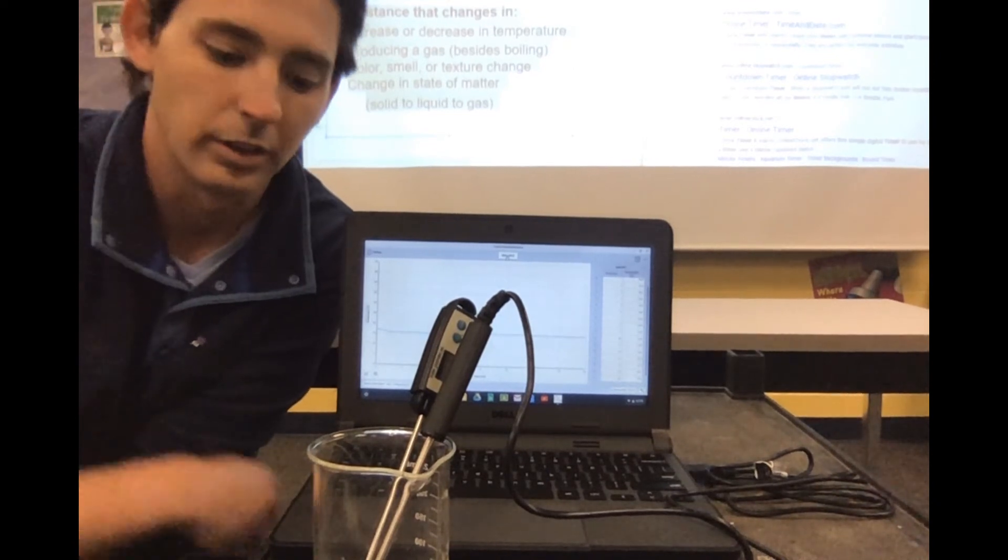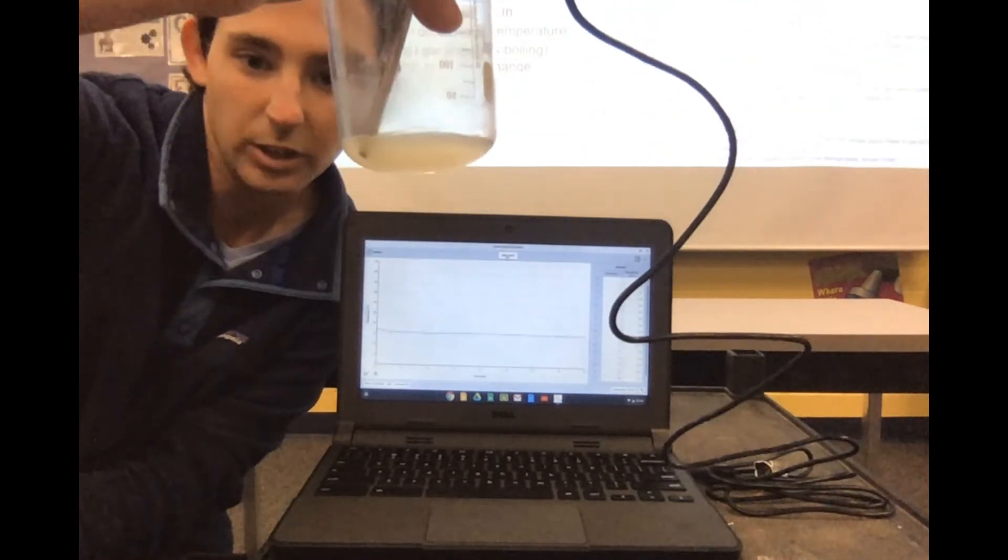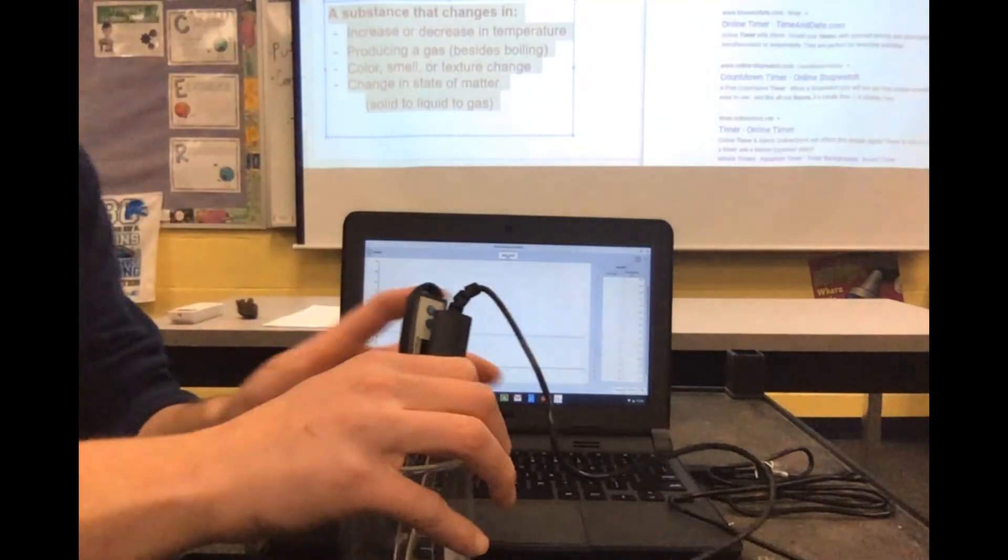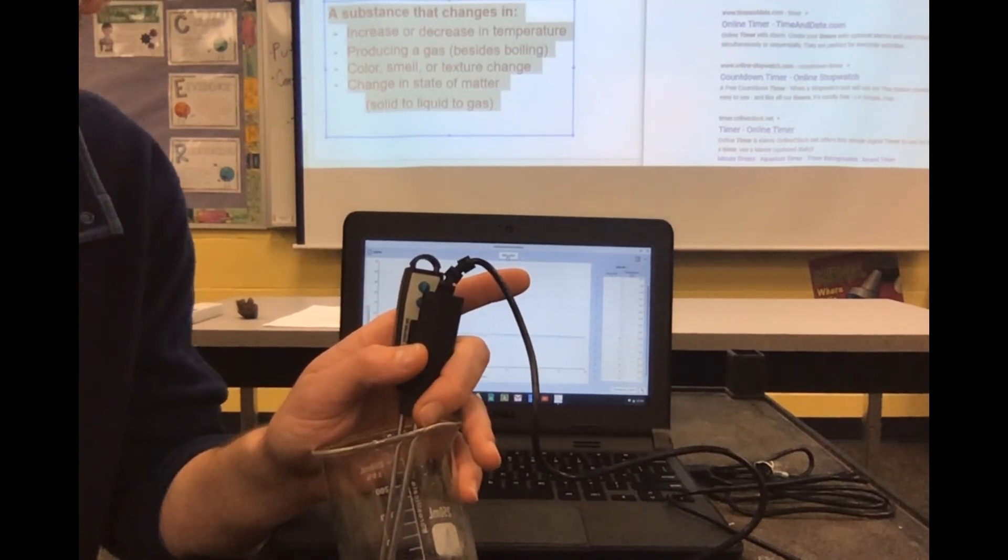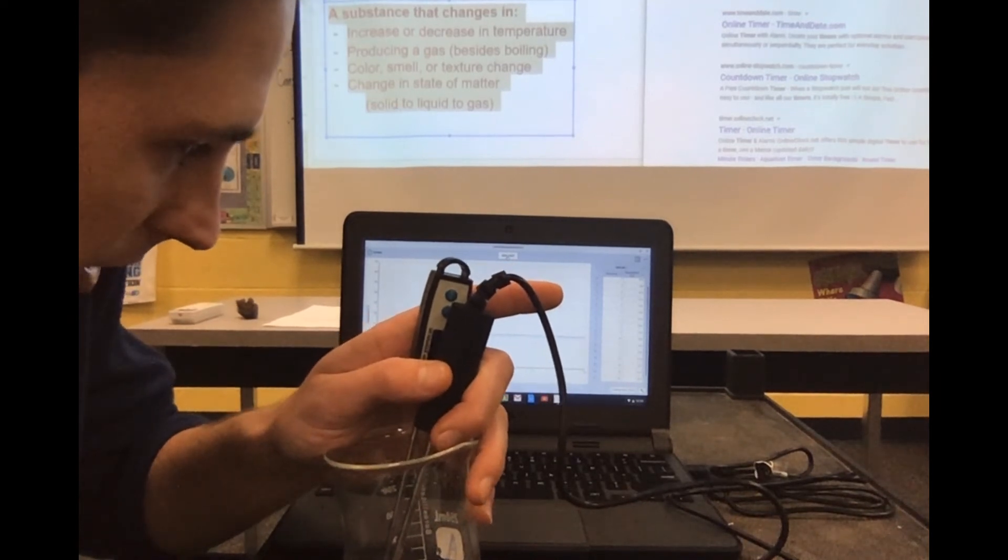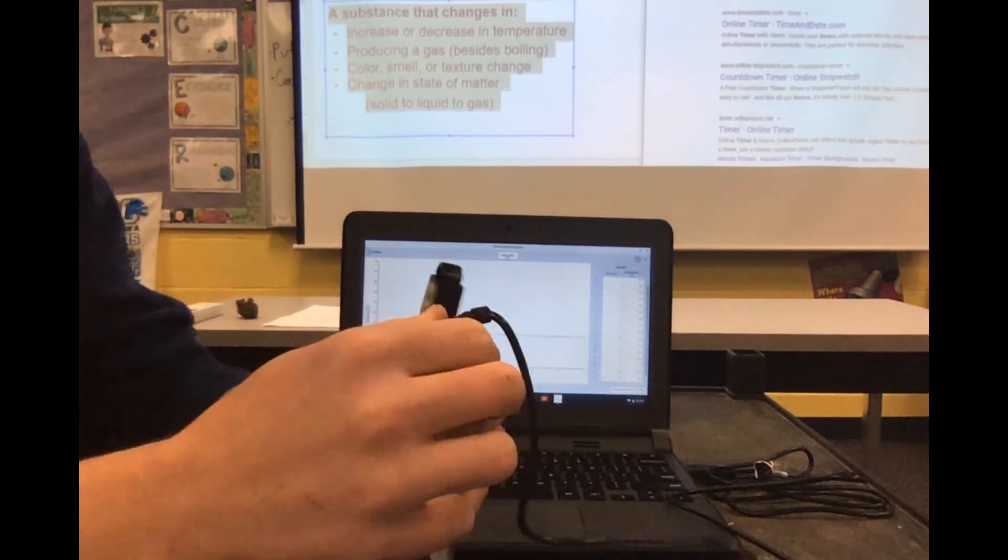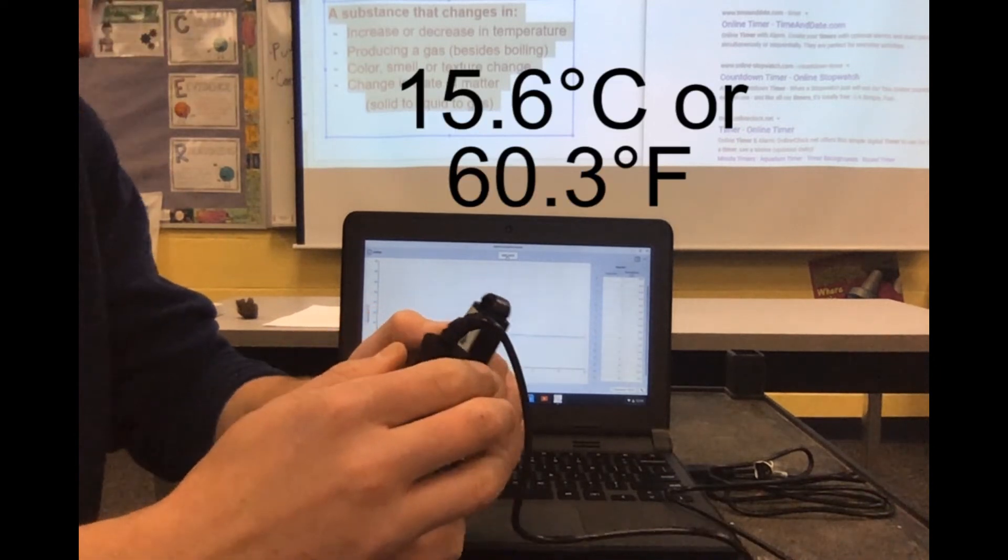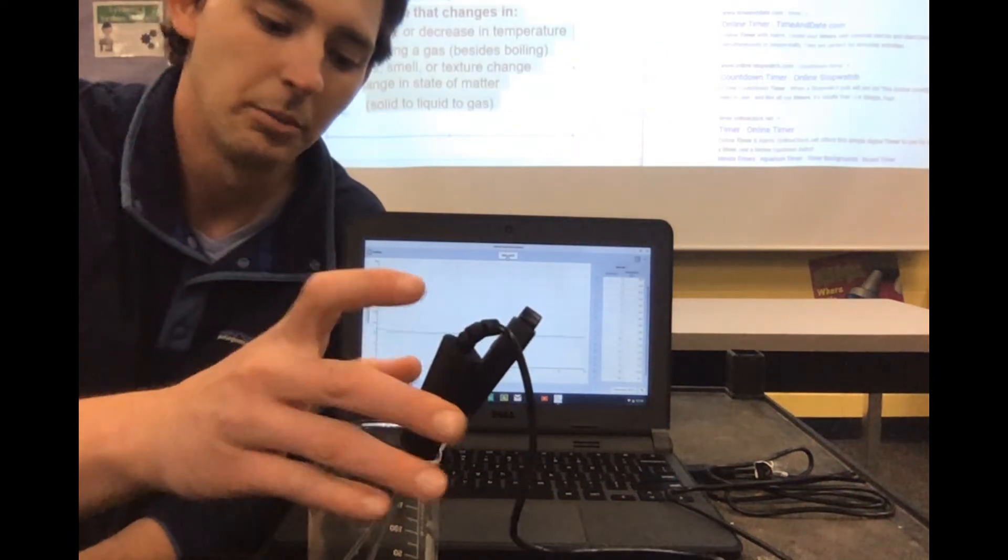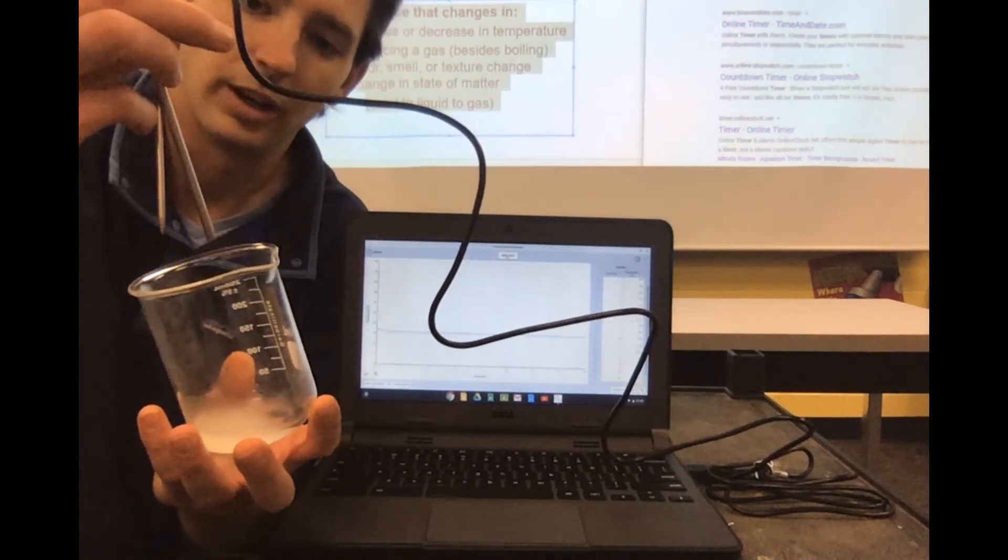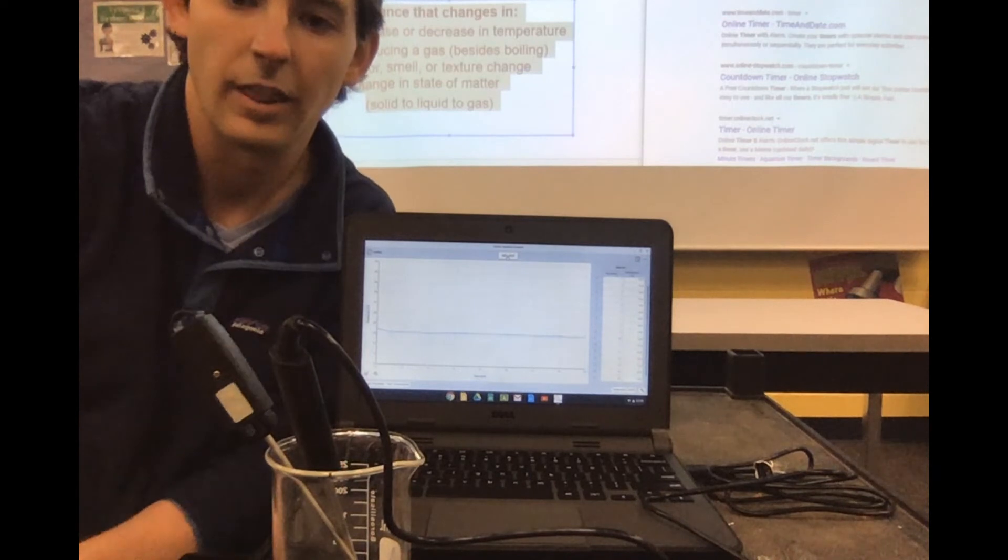15 seconds for your last one. Any other observations you can see to write in your data table, it looks like there is much less liquid now than there was. And let's see about the final temperature. 15.6 for some reason, and this is 60.3. So the temperature did decrease, but it also increased just a little bit, but that's not due to the reaction. That's probably because there is a little amount of this and the temperature that's actually being read is some of the air temperature because this is much longer than what is submerged in the liquid.